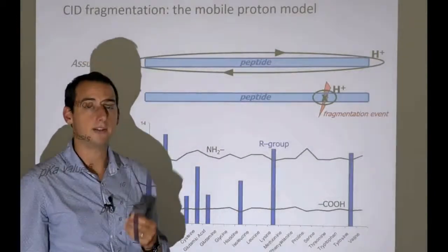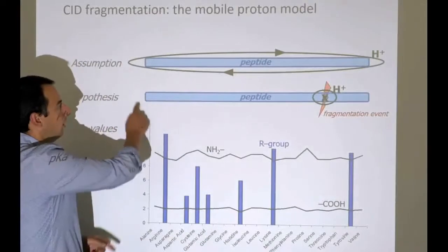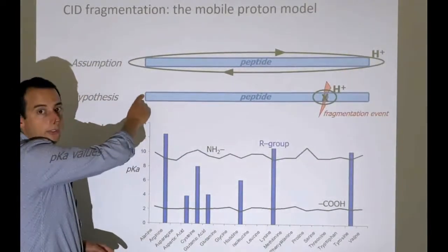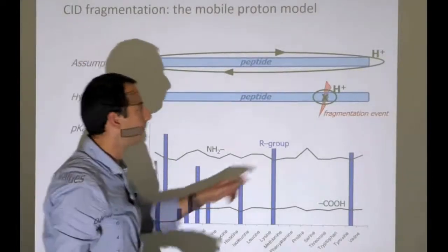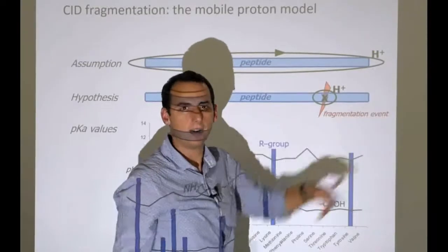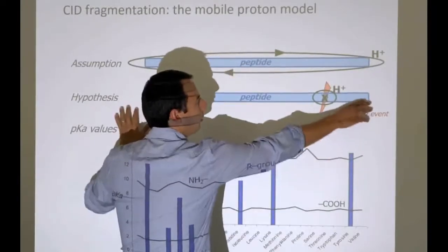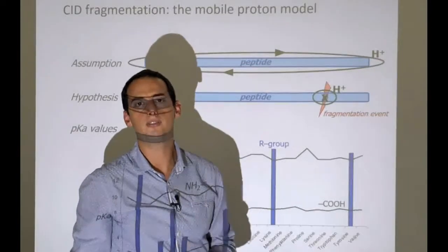So any peptide that starts on a proline will have a really nice location for a proton on the N-terminus. And if that peptide should end on a lysine, there will also be an equally attractive position here. Now imagine that. There are two positions where a proton can be held reasonably easily and roughly equally stably.